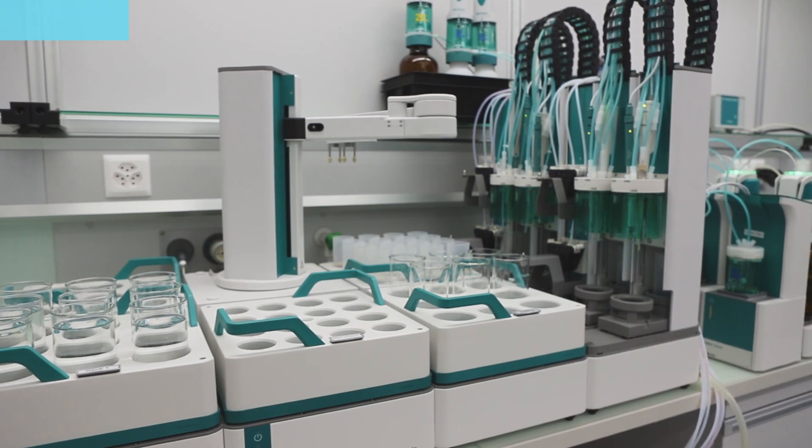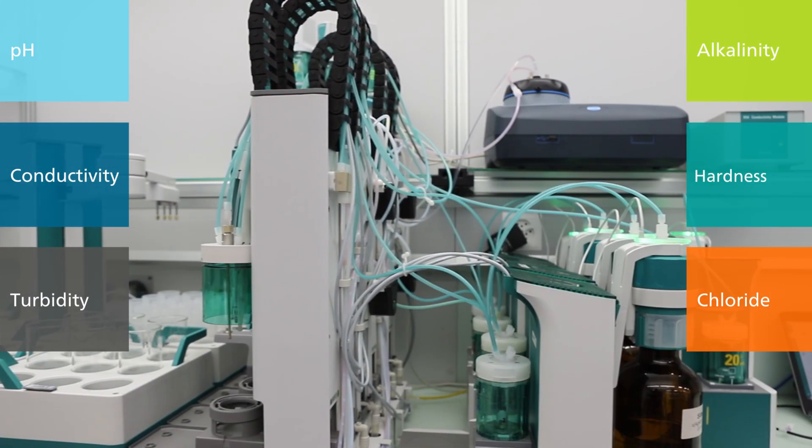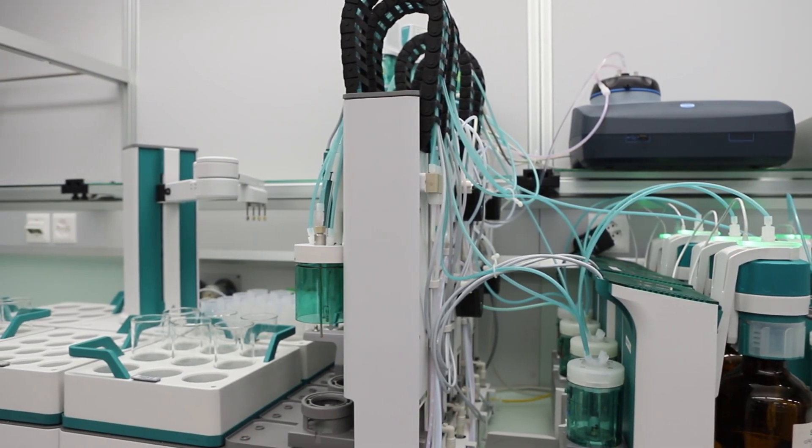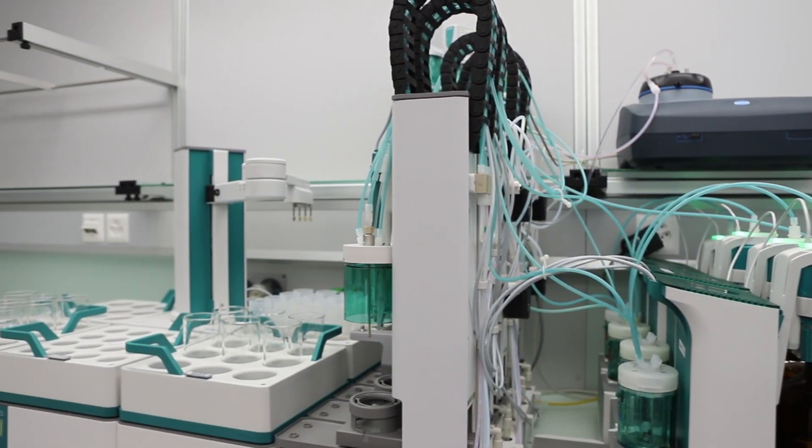High sample loads in environmental labs request an automated setup like the Omnis sample robot pick and place. The system has four workstations mounted.